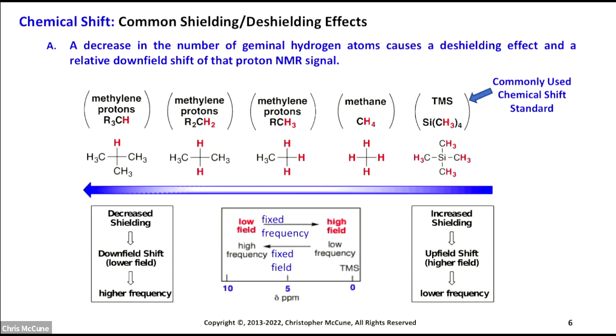This has 0.00 ppm. Not always, but if you were to use TMS, a little bit of it in your sample along with the compounds of interest, and you find that proton in the NMR and set it to 0, then it'll set all the others relative to that. And so that's used as a standard.